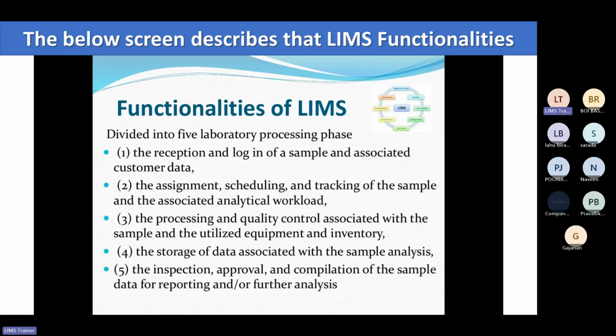Like the reception and the login of the sample. Whenever some sample is generated in that industry, it is required to be received by the laboratory, and it is also required to be logged into the software. Then comes assignment, scheduling, and tracking. The manager will assign that particular sample to some end user or analyst to analyze it. Then it will be scheduled, and the tracking of the sample. These are the functionalities related to the sample.